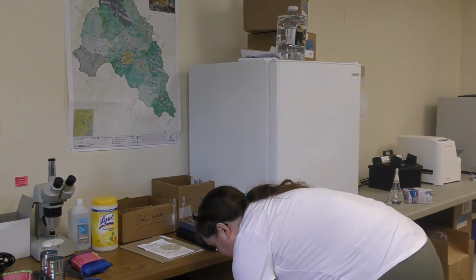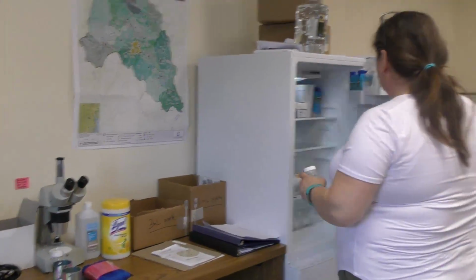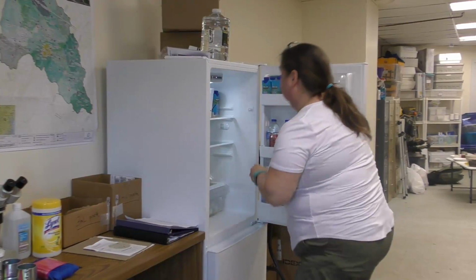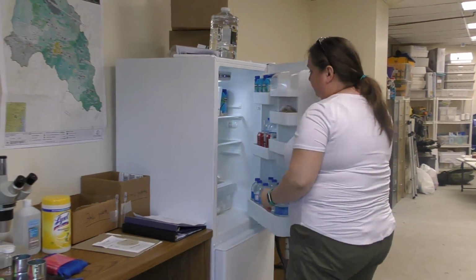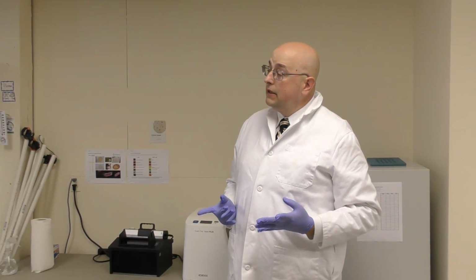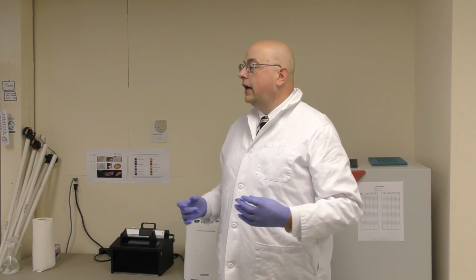When the samples are brought back in, it's good to put them in a refrigerator or the designated location, that is either a cooler with ice or a refrigerator. Keep your samples chilled until the technician processes them. For environmental samples here in Virginia, we allow up to 24 hours holding time. So if everyone brings in their samples, say on Thursday, they can drop them off, and then Friday the technician can come in and process the samples. Of course, they would have to come in the following day to read them.